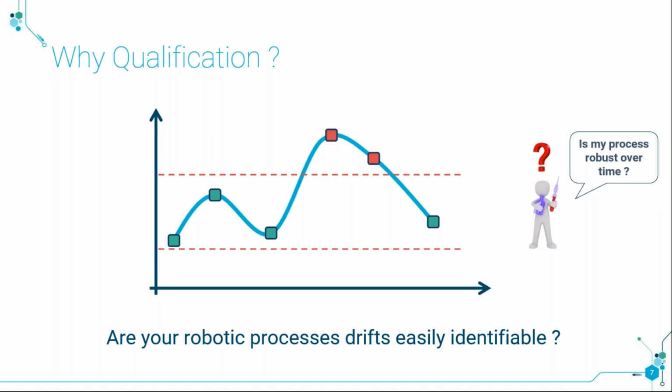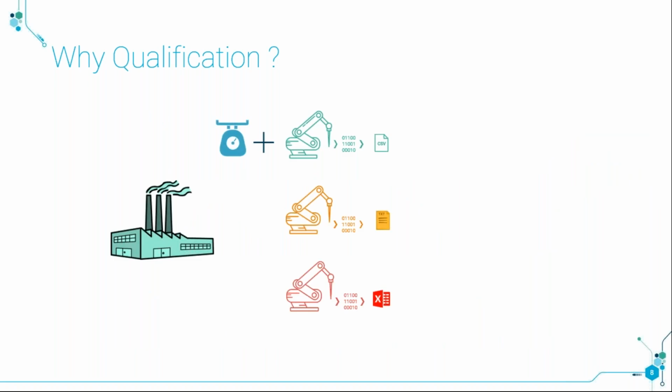But it's also here to answer a lot of other questions, because let's say that I'm a scientist working in a company. Obviously, these days we are all working in a green company. And in my lab, I have many devices: balances, liquid handlers, readers, absorbance readers, fluorescence readers, and many devices, and the output files never look the same.